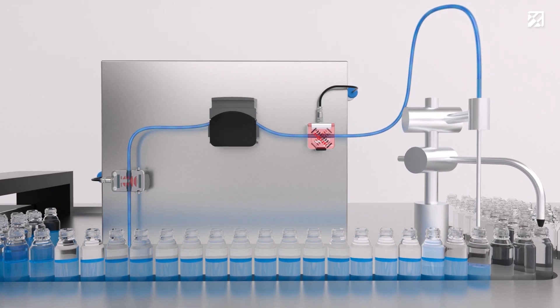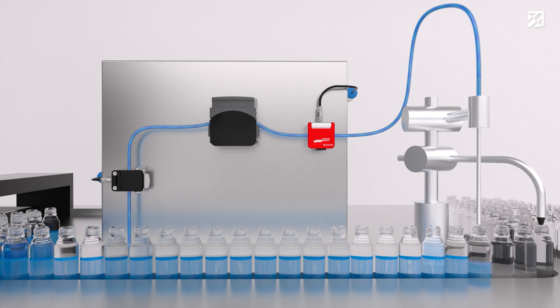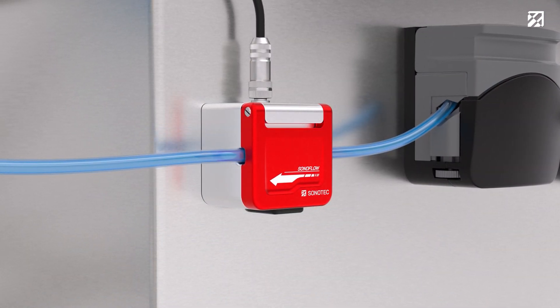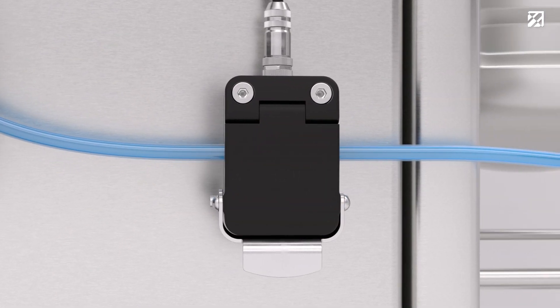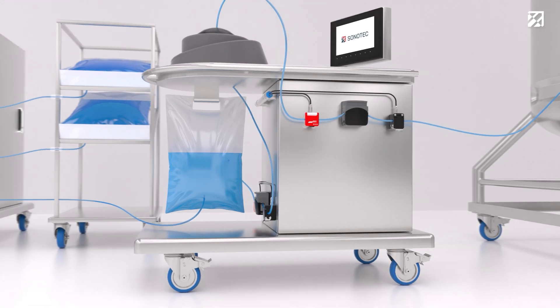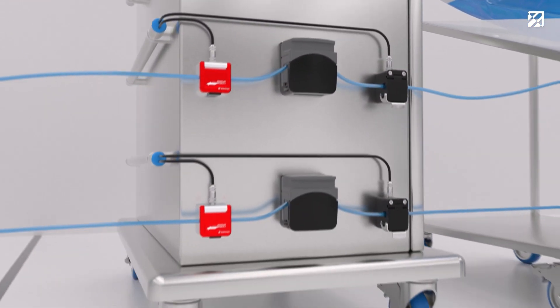You can flexibly implement non-contact flow and bubble sensors in various process steps. The clamp-on technology combines sustainability and usability. The sensors offer the smallest footprint available on the market, as the electronics board is integrated in the compact sensor housing.